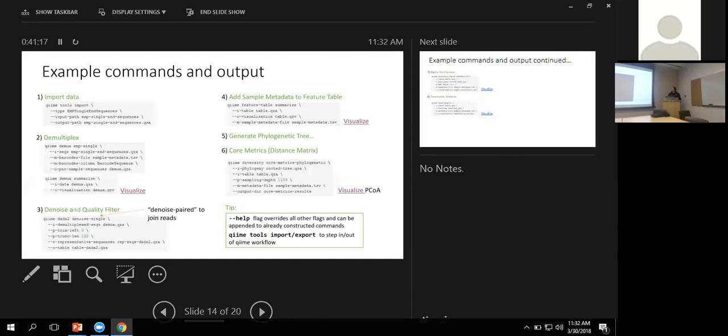The last thing here that is different from QIIME 1 is the ability to make this a two-dimensional plot. So you can switch your axes around, you can invert them, you know, so that you get the best view, but you can also hide one of the axes to make this two-dimensional. I didn't show you that it was three-dimensional first. Oops.